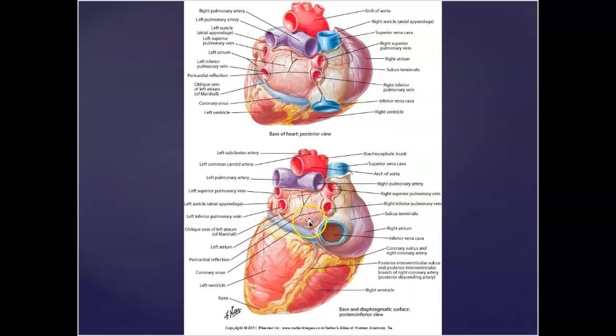So if we flip the heart around, you'll see these four holes here for the left and the right pulmonary veins, bringing oxygenated blood back to the left atrium. But what's tricky about this is that it's behind the heart. So you'll need to cut these a bit blind. So this is really the hardest part of removing the heart, is cutting these pulmonary veins as they come back into the left atrium. I hope I said that correctly. Pulmonary veins coming back into the left atrium, pulmonary arteries leaving the pulmonary trunk going to the lungs. Remember that circulation is reversed in its naming.